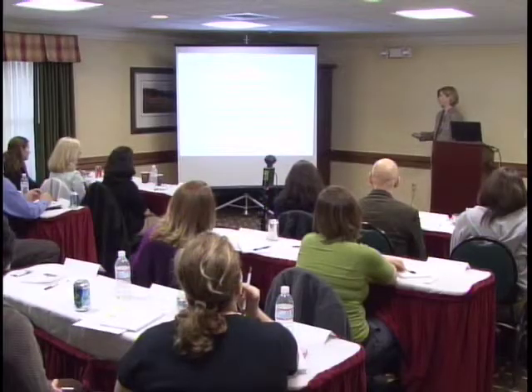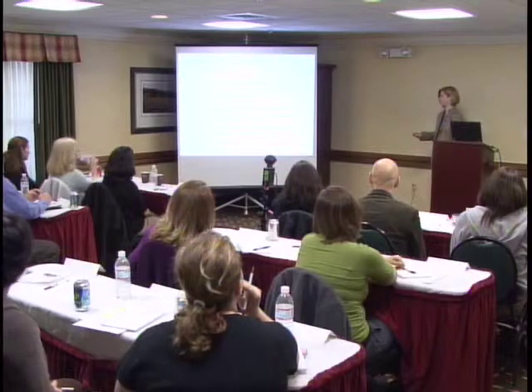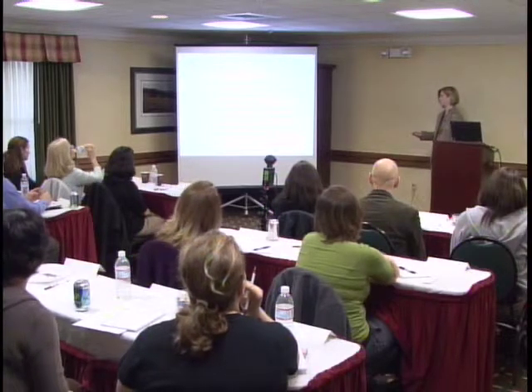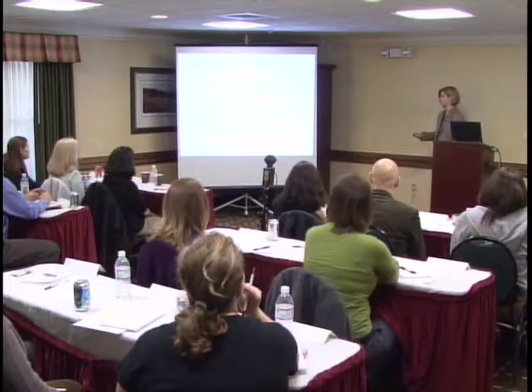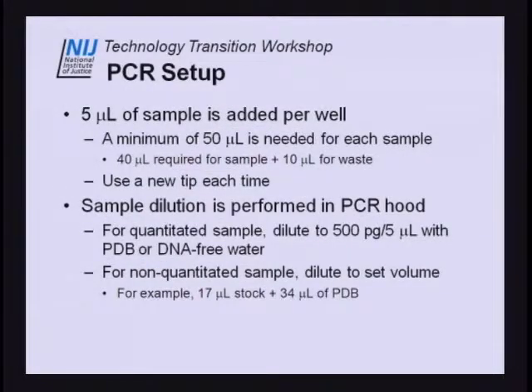So then we're going to have you guys actually set up PCR plates, when the first step is actually sample dilution, because you do need a minimum of 50 microliters for each sample to set up your plate. So 40 microliters is required for the actual sample, and then we have 10 microliters for waste, and a new tip will be used each time you're adding sample to the well. We'll perform the sample dilution in a PCR hood.